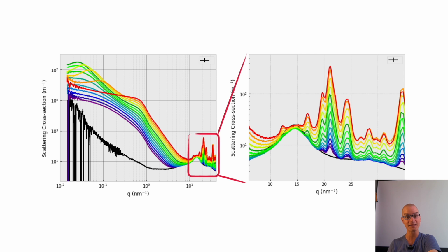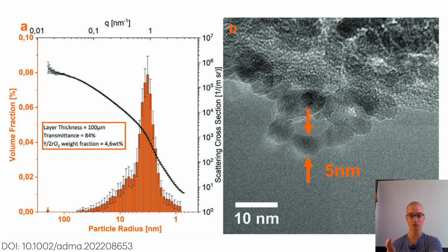And since this is a dense data set, you might now be able to play around with structure factors and find out how far you can go and what kind of analyses you can do on this data to get more information out. So we haven't fully analyzed this data set, but we do have a couple of data sets figured out. So one of them is, of course, the low concentration version. This one is shown over here. So in orange, you can see the size distribution. Do pay attention that the size distribution horizontal axis has been inverted to match the information in the scattering pattern.